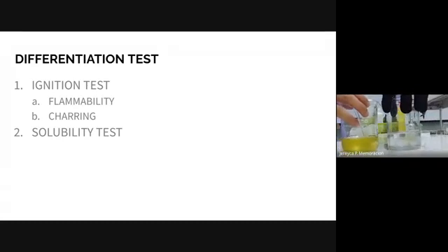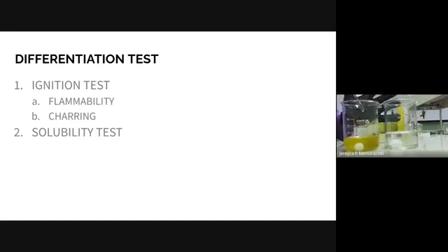Compare your results and observe the miscibility.